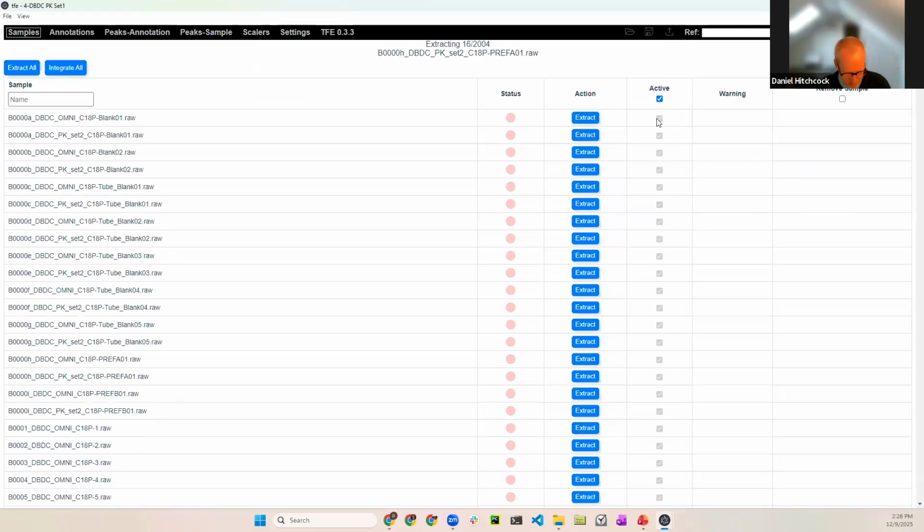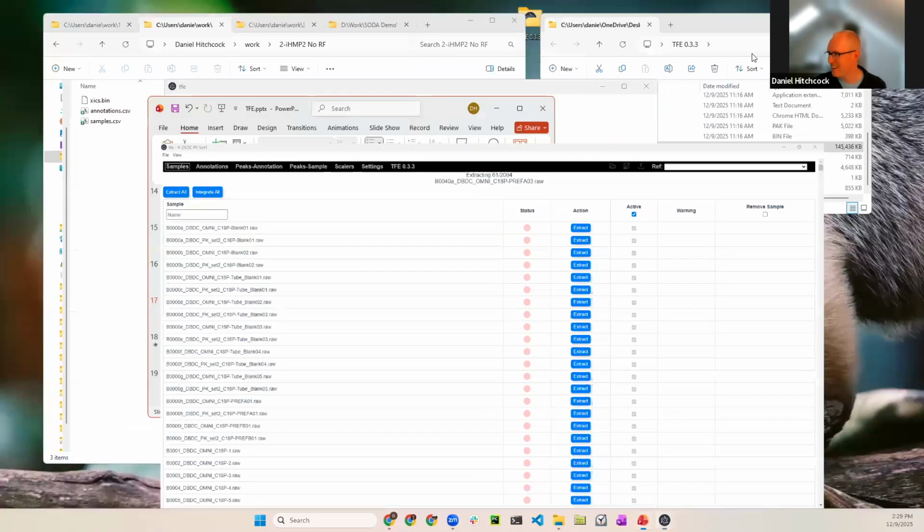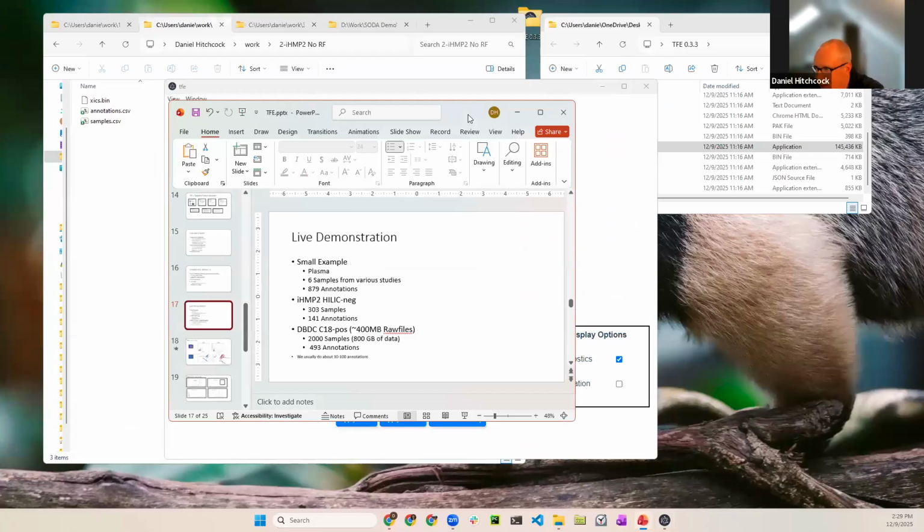And the last thing I'll say, our raw file reader is one we wrote custom, and it actually is available as a Python package. It's written in C. It reads the whole thing into memory and parses it into a common format. Works with mzMLs too. We'll figure out how to make it faster someday. But anyways, okay, while that's going, back to the presentation.